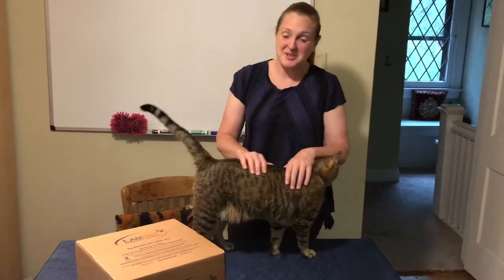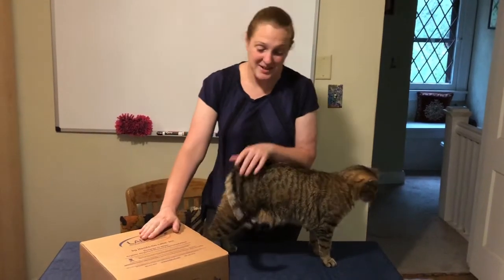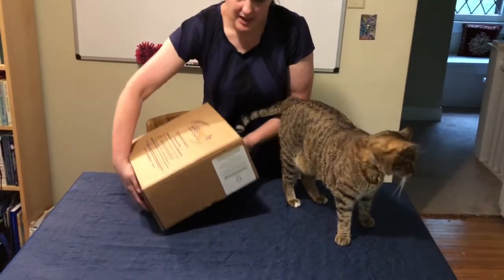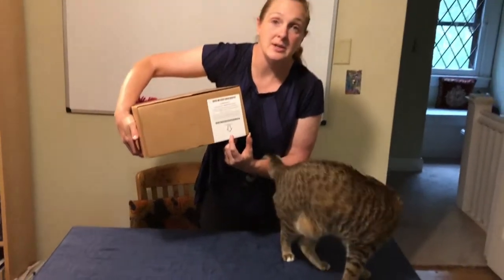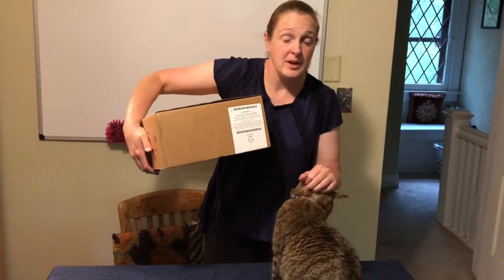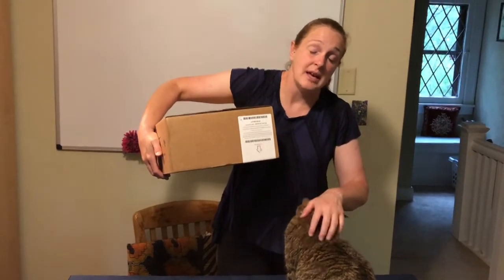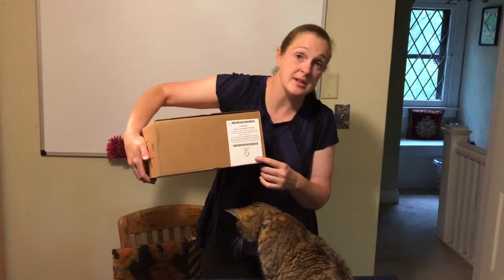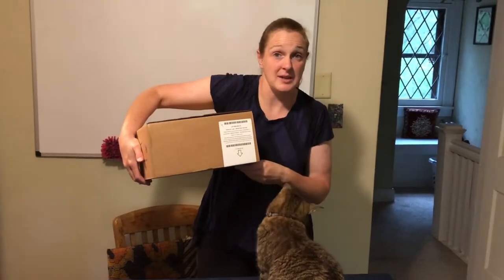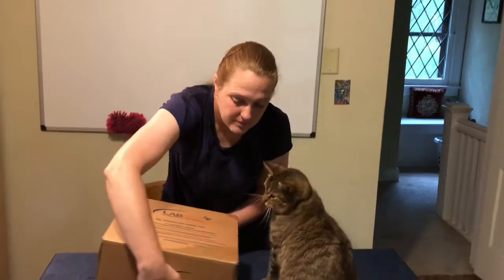Today what I wanted to do is show you the hands-on lab kit. My kit did arrive and when you unpack your kit, the thing you're going to notice on the side is the code. This is the code that you're going to enter online. When you go to the Eagle Course site and click on hands-on lab or any of the labs themselves, the software is going to ask for the lab kit number and your email address. This way it can pair you and your kit with the work that you're doing online.